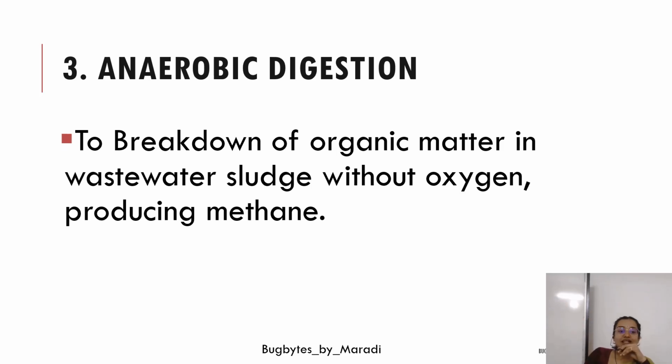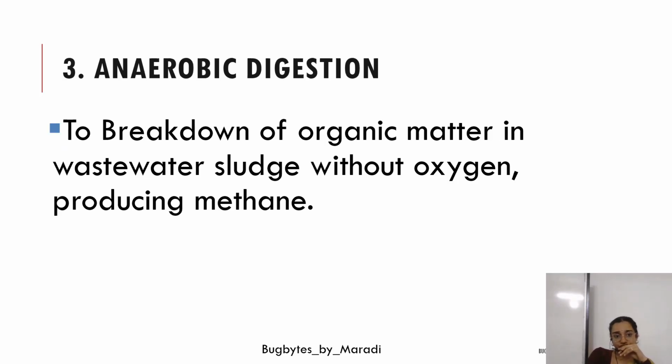Okay, so for that they'll be checking the alkalinity. They'll be determining the alkalinity of the water sample, or it will be the wastewater sludge. So, overall, alkalinity is very crucial, to control the parameters in the various different treatment processes.